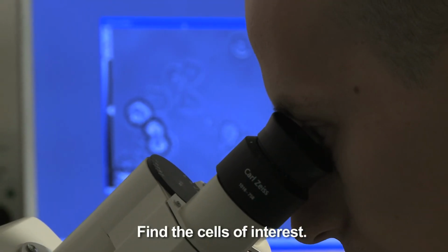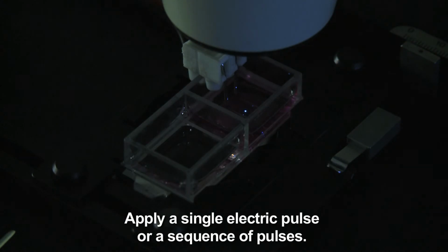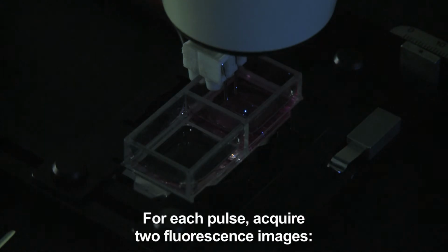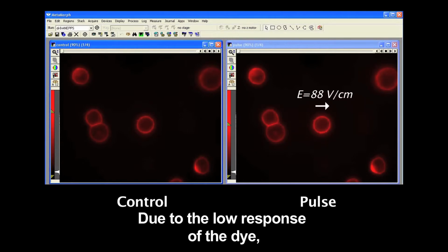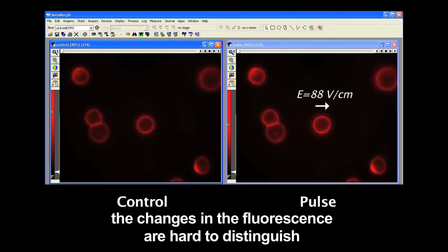Find the cells of interest. Apply a single electric pulse or a sequence of pulses. For each pulse, acquire 2 fluorescence images: the control image immediately before the pulse and the pulse image during the pulse. Due to the low response of the dye, the changes in the fluorescence are hard to distinguish and become apparent only after processing.